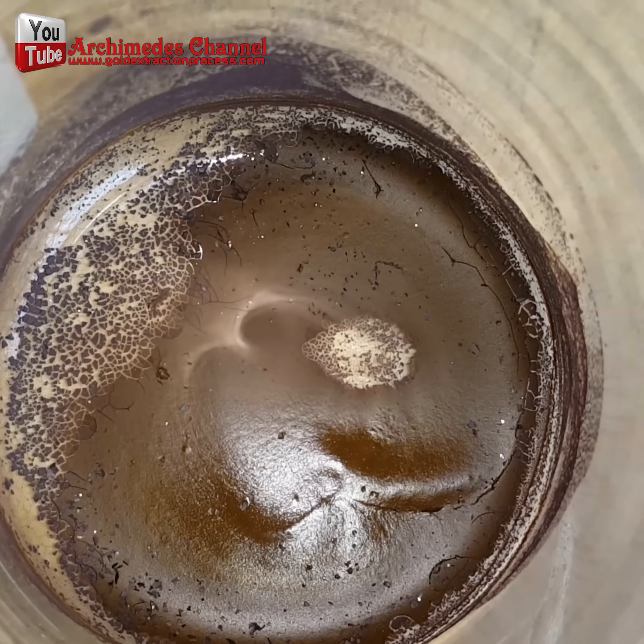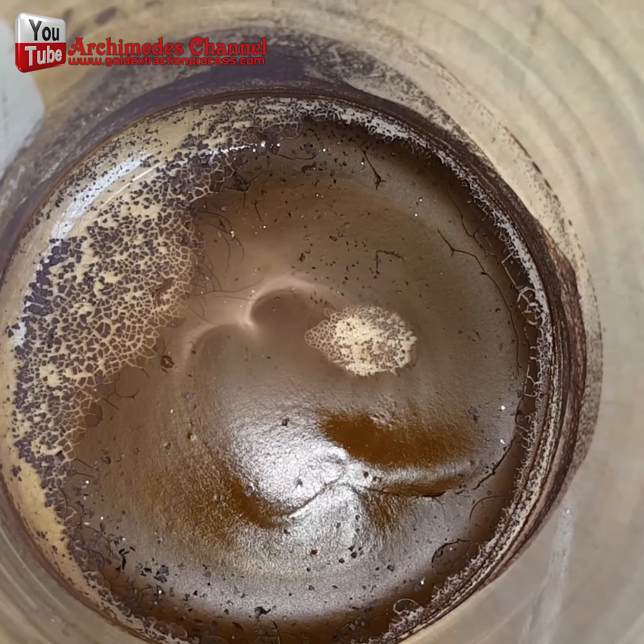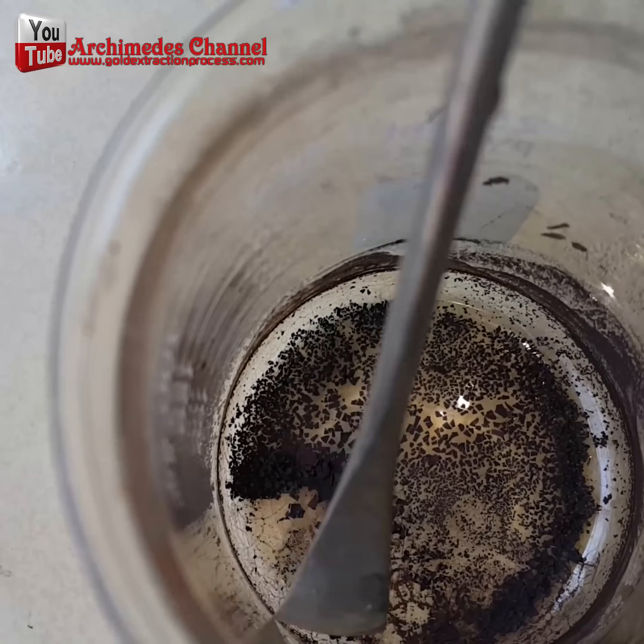Then, I completely dried the gold sediment out with a careful use of a hot air blowgun.